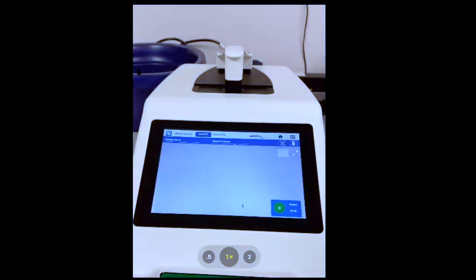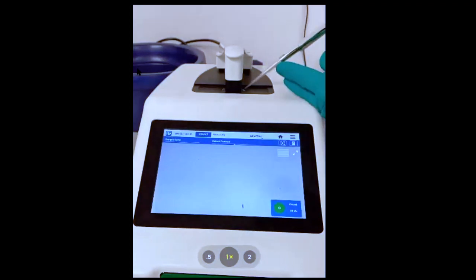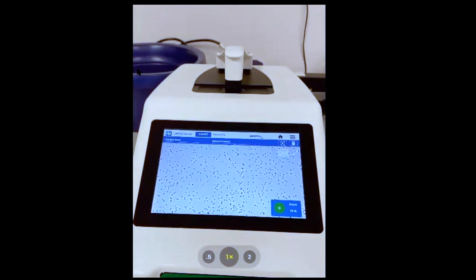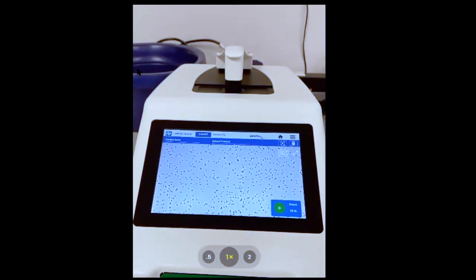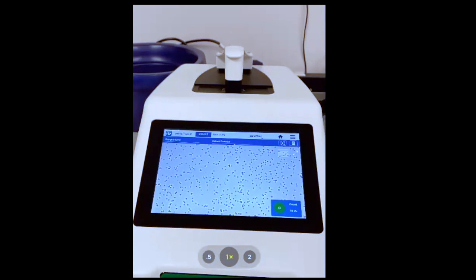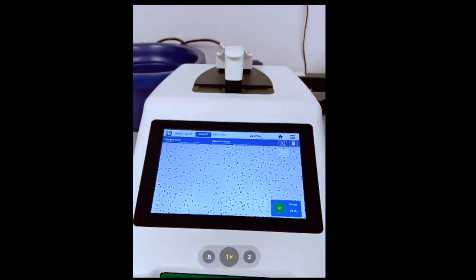So Dan, we had a question about whether the counting methods can also apply to white blood cells and red blood cells, counting by hemocytometer too. I think the question is, do these principles that you've discussed apply to counting by hemocytometer too?